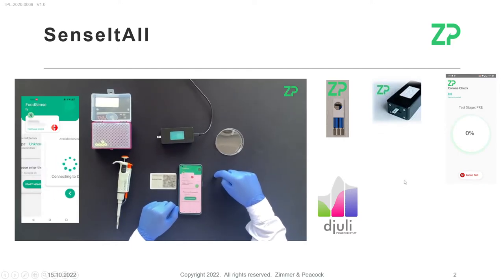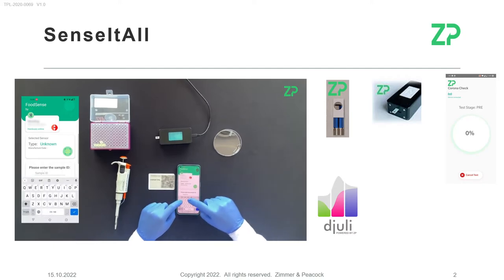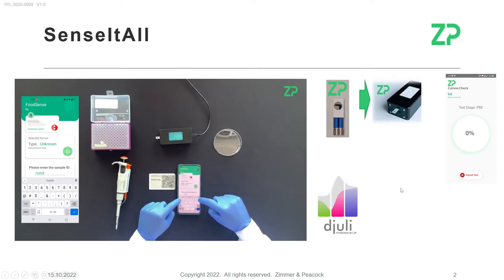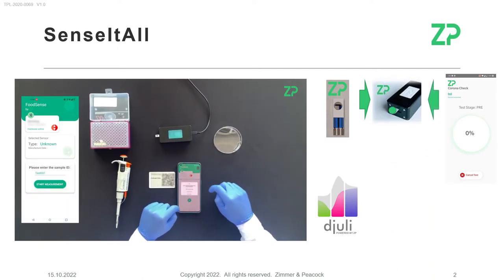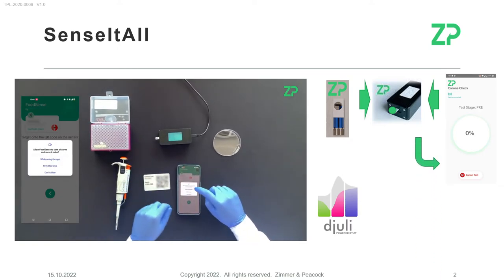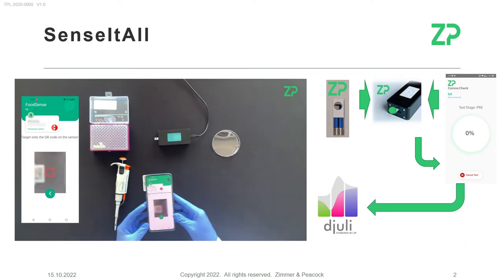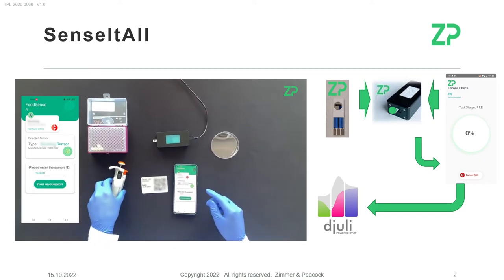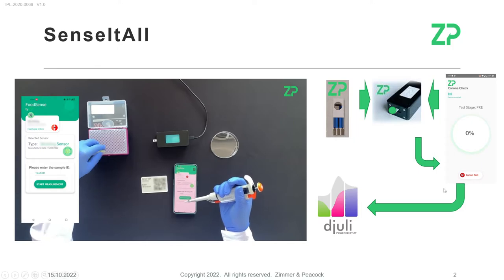We're putting samples of whiskey onto the sensors. The app is telling the sensor what to do, and the sensor — and therefore the meter — is giving the data back to the app, which then passes the data to the cloud system called djuli.